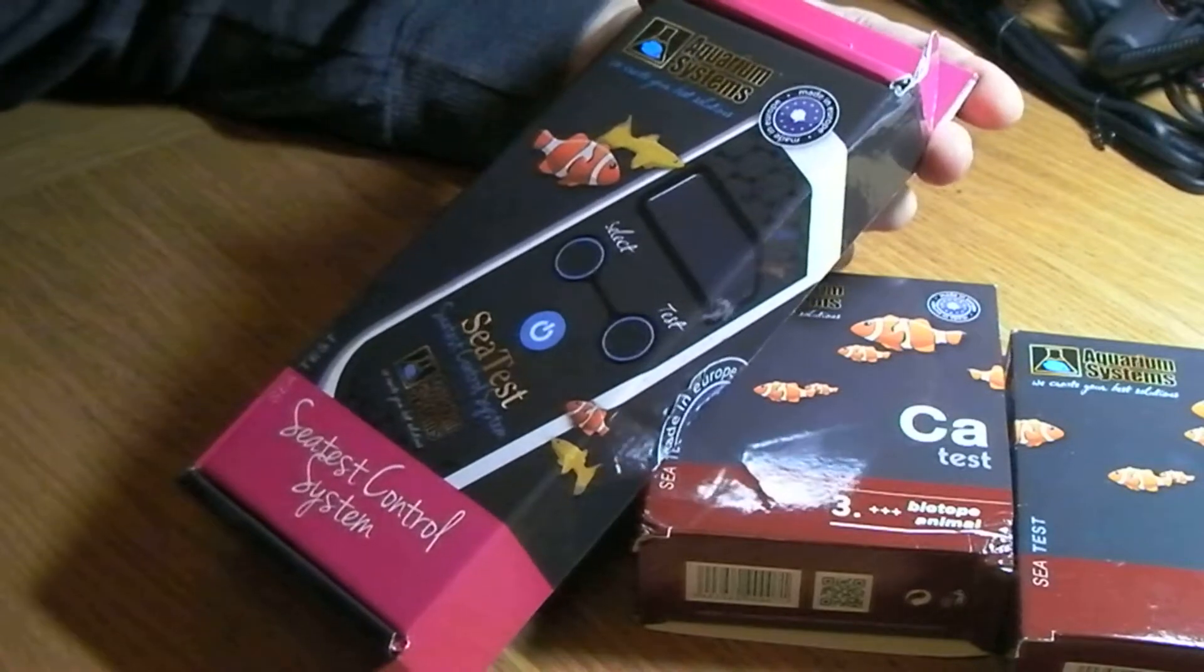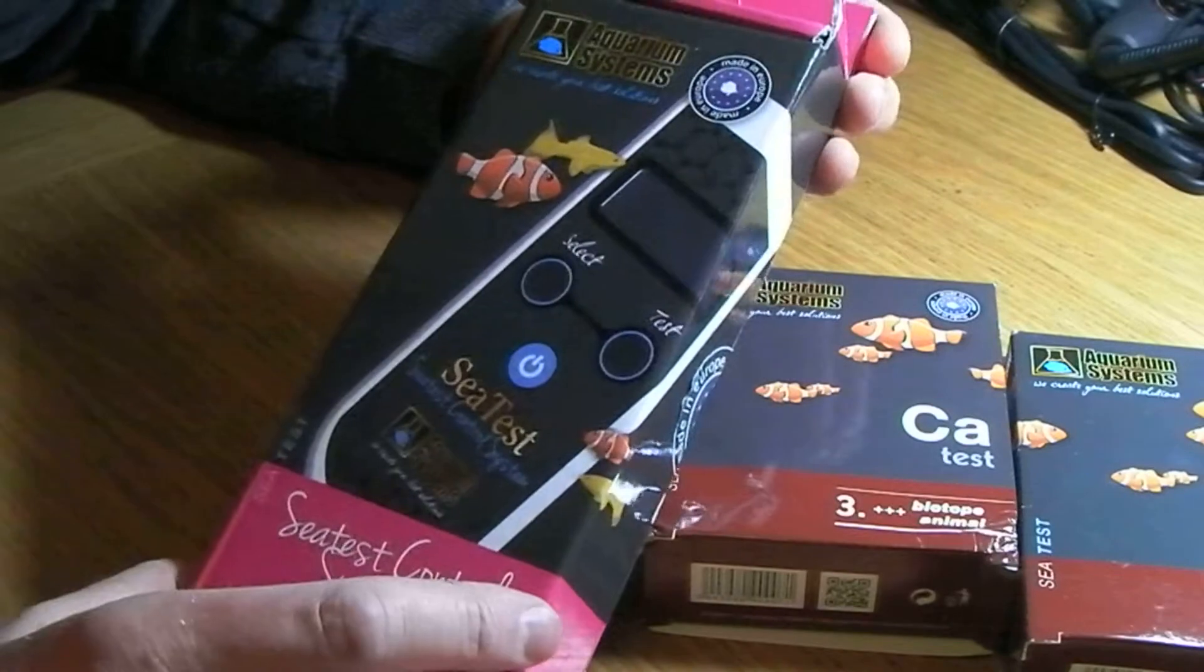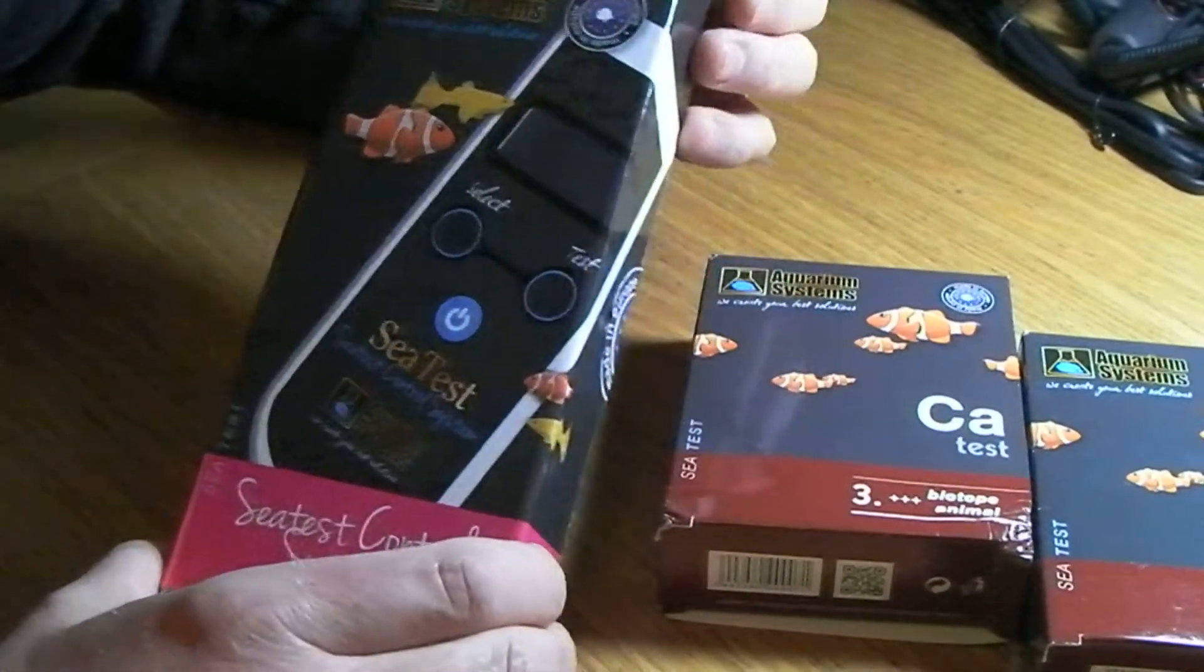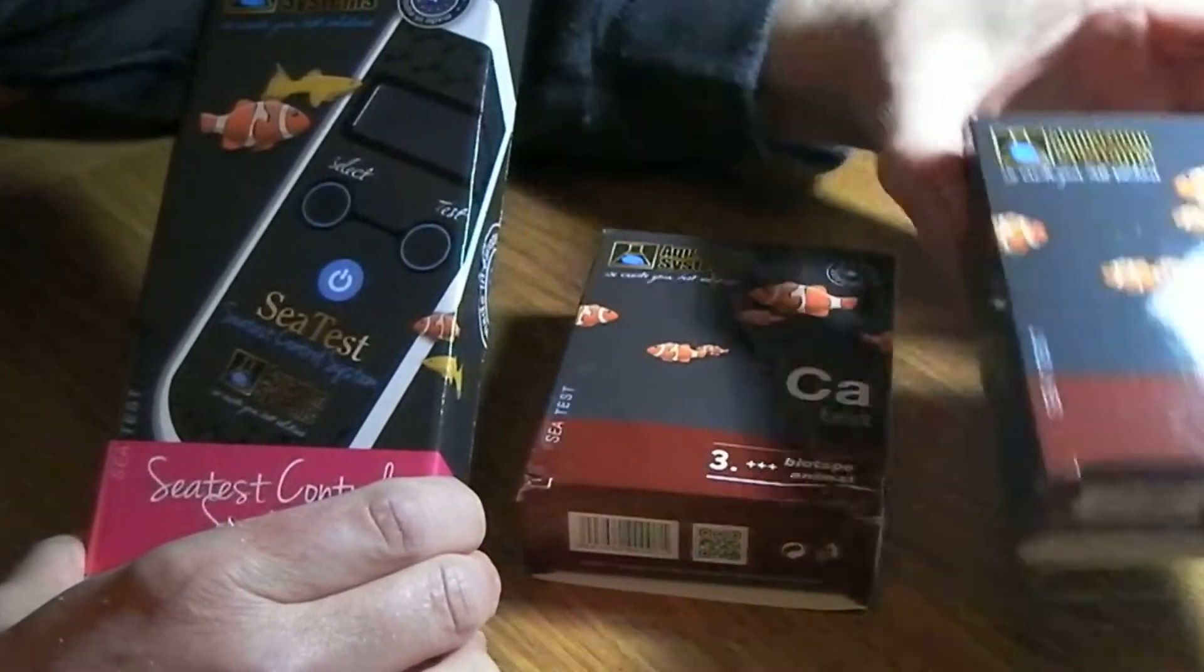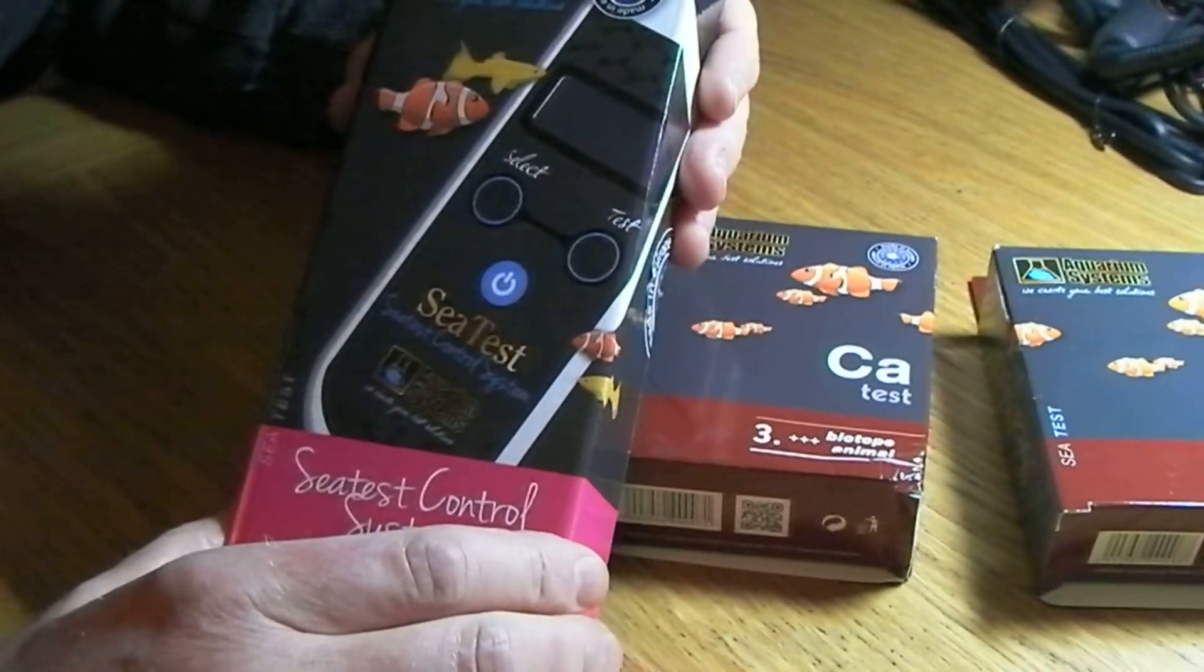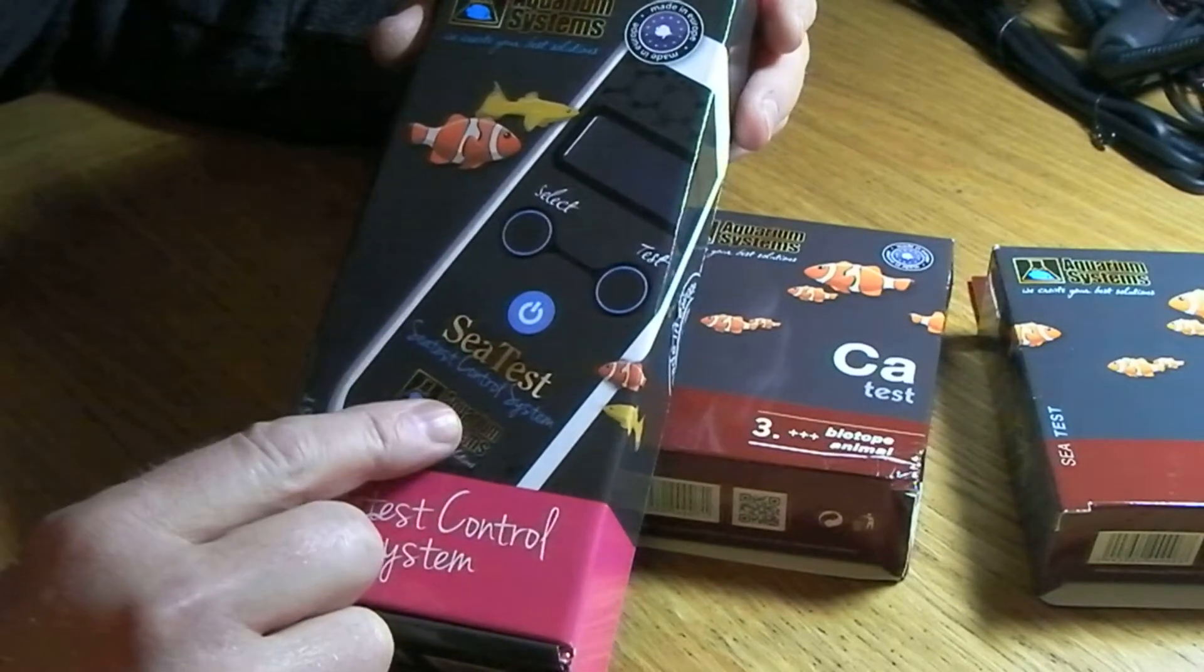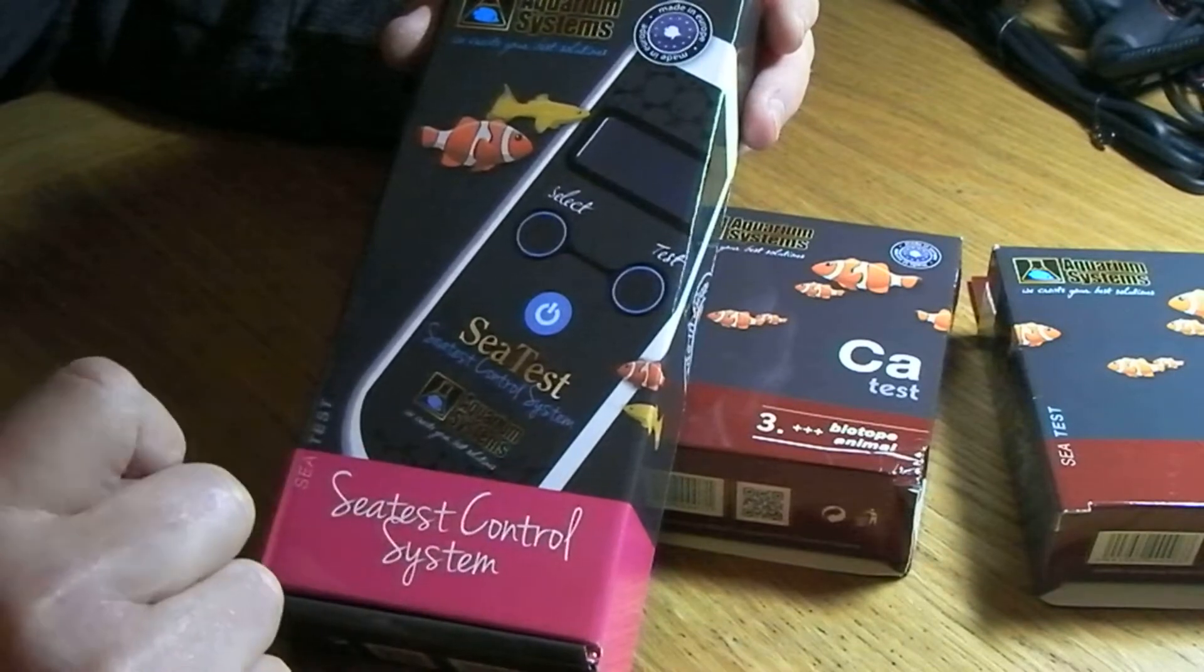It's called the C test control system and it's by a French company. The product's actually made in Europe as well. What you use it in conjunction with various C test test kits, and you dip the end of the device into the resulting colored water and it gives you an LCD measurement.